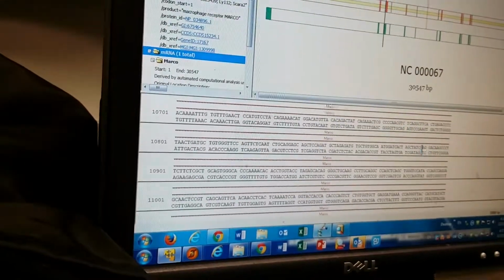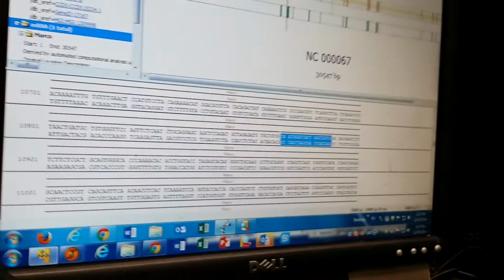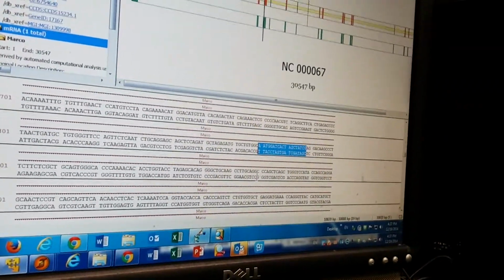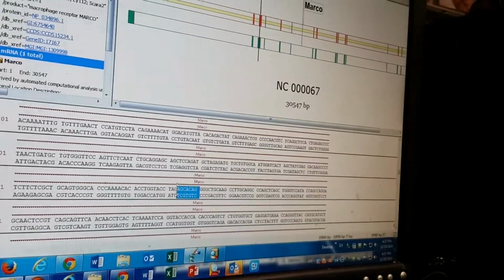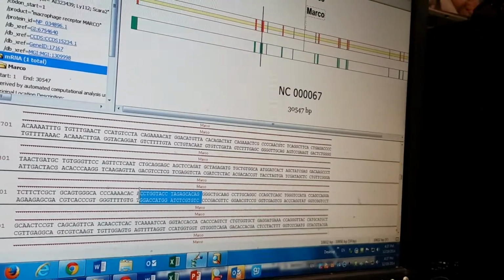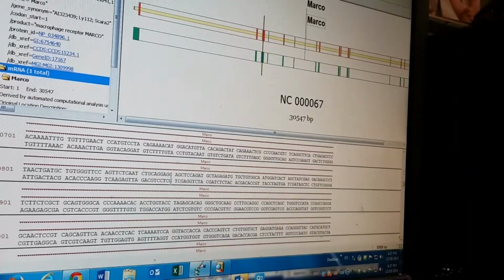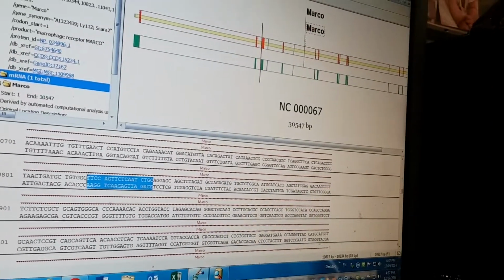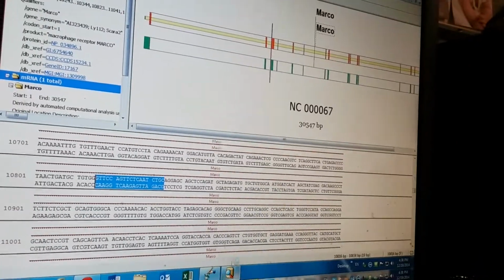Okay, there are 2 G here. Then from here, 19 base pair. This is 20. No, this is not good. We'll try. I'll try this. 19. This is not good. This is G. Oh, this is another good site for CRISPR targeting.